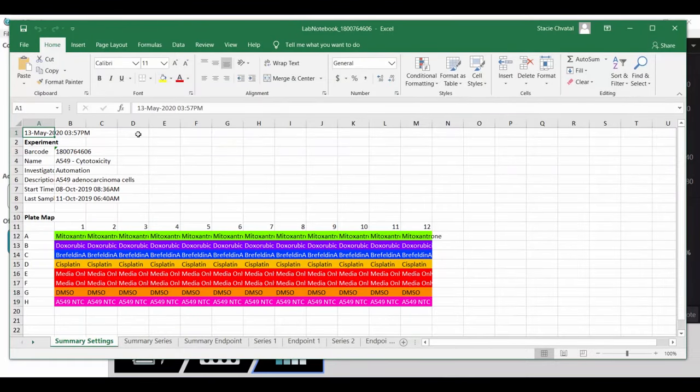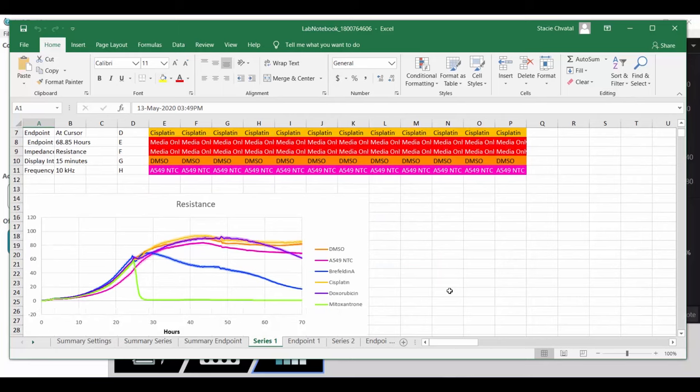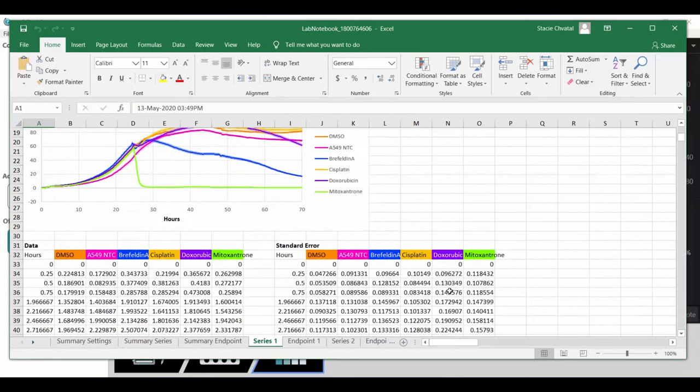The file, plate map, and analysis settings are exported for traceability, along with fully editable Excel charts and linked data tables.